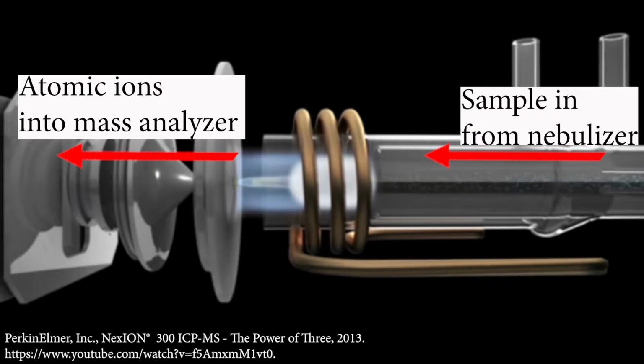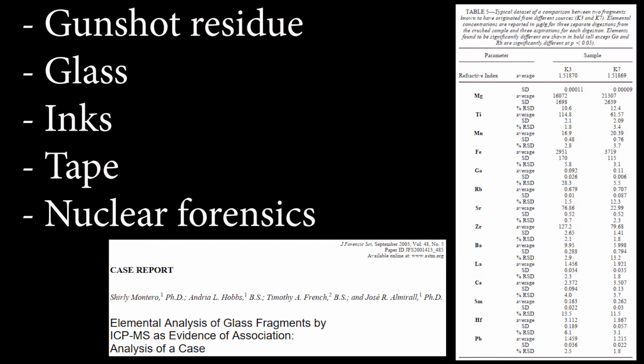We actually have one in the lab. They have to have welding glass there. You can't look at it or it'll blind you, but it's actually not that hard to get them. You can pour energy in them, so it's not that hard to make them really, really high energy.